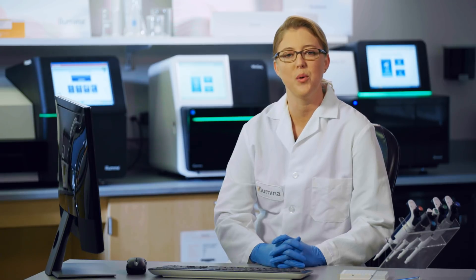Hi, my name is Wendy and I'm an applications trainer here at Illumina. I'm here to give you a brief introduction to Illumina's newest prepared sample-to-analysis solution for amplicon sequencing, AmpliSeq for Illumina.